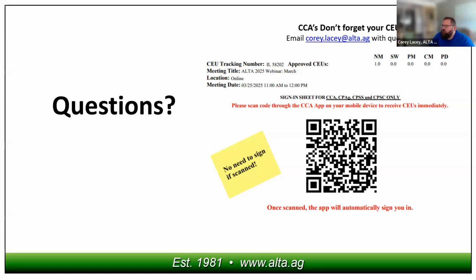So I will say that I've worked with a few labs that have this issue, especially when they're using scandium. I don't know if it's scandium specific, but that's the internal standard being used. They're inline, they're using an internal standard. The internal standard initial will come back at 100. If you run blanks, it will come back at 100, which makes sense. But when you're running actual samples, the readbacks will be, I'm not sure about in Jim's case, but in my experience, usually several percentage points higher. And when you look at how it's correcting the data, it actually causes some issues.